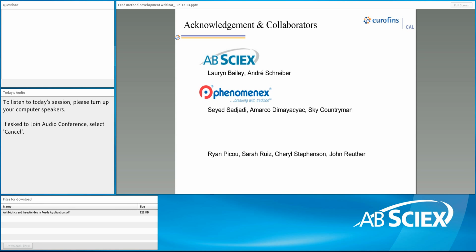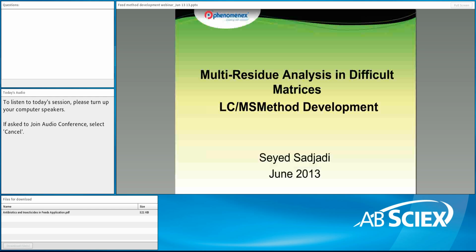Thanks, Kurt. I'm going to turn it directly over to Saeed, who will continue with discussion of the LCMS method development and the chromatography. Just to remind everyone, if you do have questions for Kurt or Saeed, you can put those questions in the top left-hand box on your screen. Saeed, take it away.